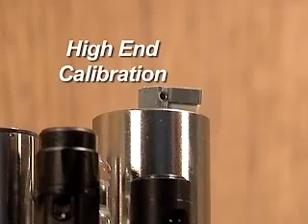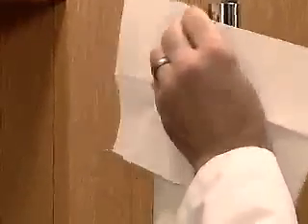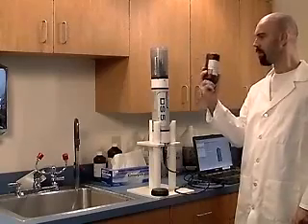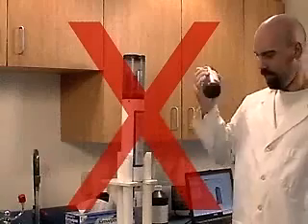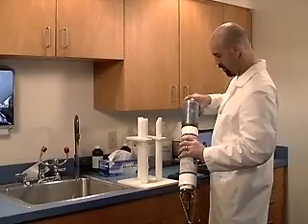High-End Calibration. The high-end calibration point should be a value higher than the highest value anticipated at the deployment site. The standard factory high point is 100 NTU. Pour the deionized water out of the storage cup and dry the sensors again. Gently swirl or invert the bottle of 100 NTU stable cal for 2 or 3 minutes to mix the suspension. Do not shake the bottle of stable cal, as this will suspend air bubbles in the solution and change the turbidity of the standard. Pour the stable cal into the storage cup until it is about 25% filled.